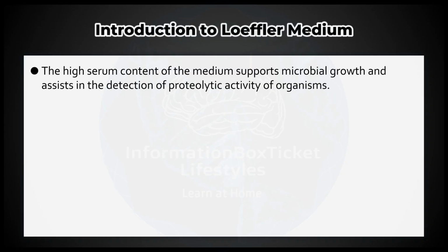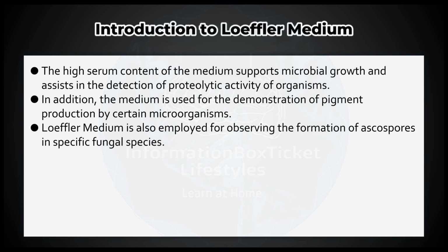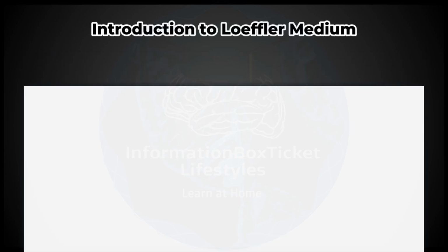The high serum content of the medium supports microbial growth and assists in the detection of proteolytic activity of organisms. In addition, the medium is used for the demonstration of pigment production by certain microorganisms. Loeffler Medium is also employed for observing the formation of ascospores in specific fungal species.